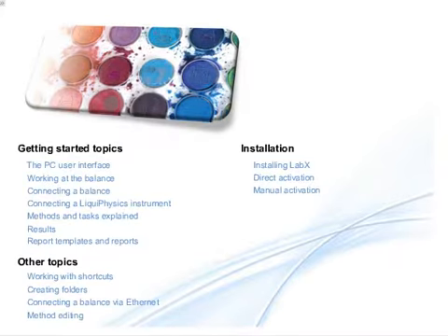In this presentation, we have shown you a quick overview of the main LabX activities when running a method. We have also shown you how to create a report template, and how to configure the template to fit your company's needs. Additionally, we have also presented how a report template can be utilized to generate reports, how the reports can be further fine-tuned, and finally, the large options available in exporting your reports.